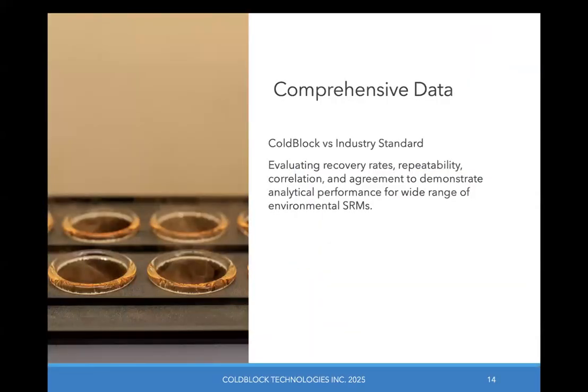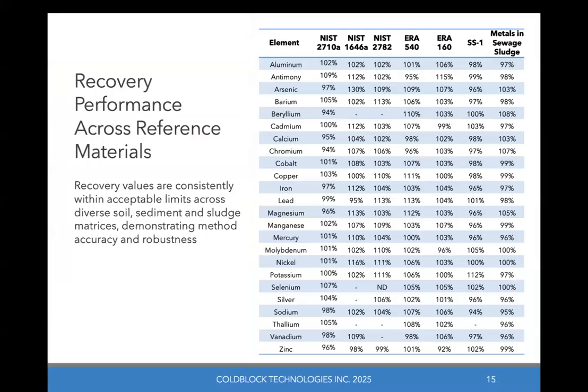In the next few slides, we will flip through the data that we've received and recovered. We'll present the summary results, but please, if you're interested in specific details, please don't hesitate to reach out to our team following the presentation. So we'll start here looking at average recoveries achieved across the CRMs that were analyzed. Again, you'll note that the data here includes data for mercury.